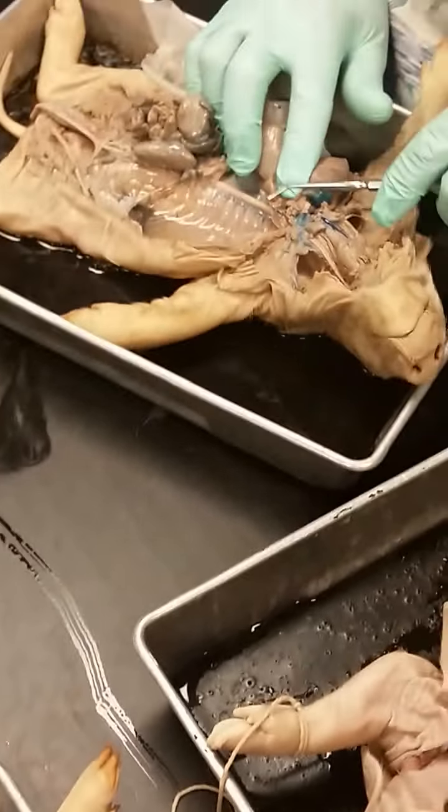So here's the phrenic nerve. Got it? And it comes right down along the vena cava. Of course, the two lungs, notice the shiny surface, that would be the visceral pleura. And then if you come over here, and sometimes I can get it and sometimes I can't, there it is. See that peel? I'm peeling it up off the surface. It's a real thin little membrane. That would be the parietal pleura that would line the inside of that cavity.